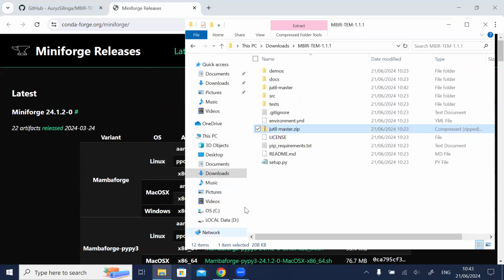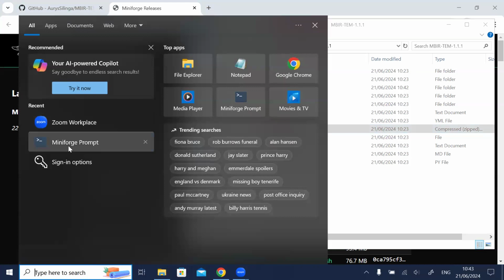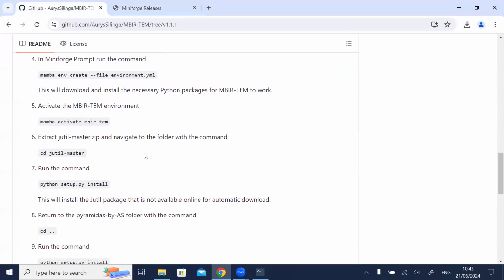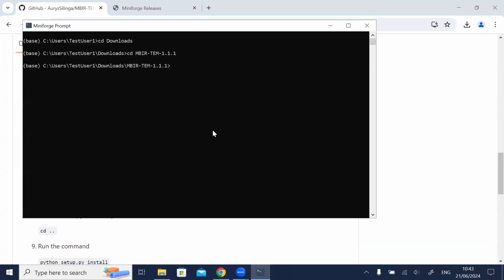Okay, now that's done. It is usually somewhere in the start menu. And well, let's navigate to our source folder. It's going to be in downloads under here. So then let's have a look at the installation instructions. Use this command to set up the Python environment.